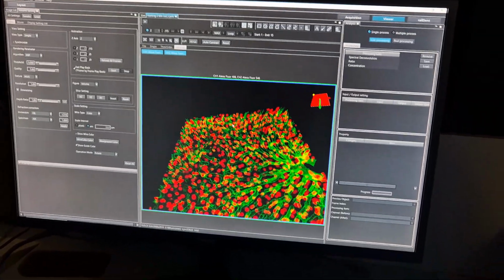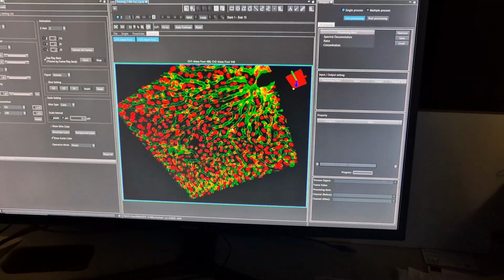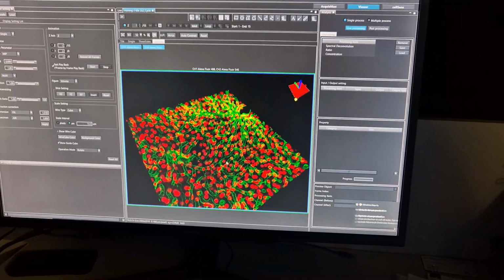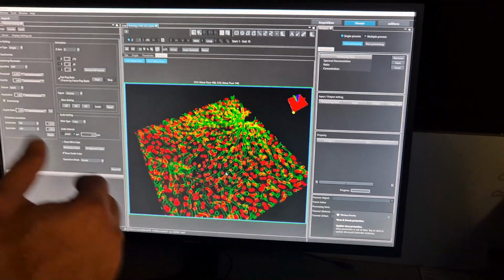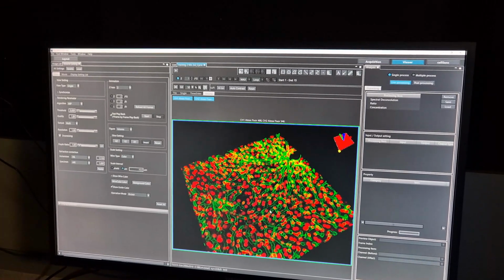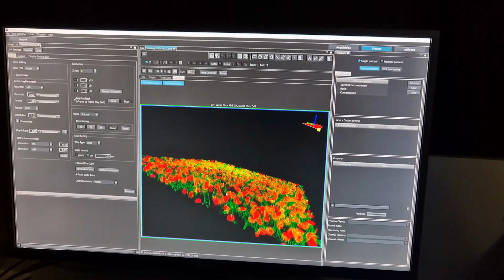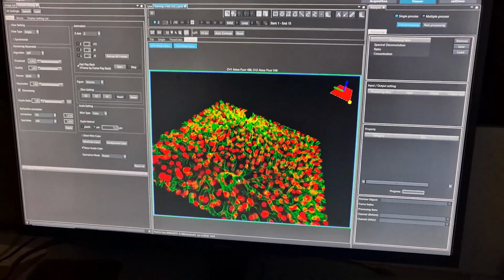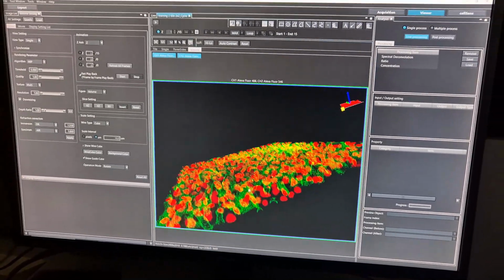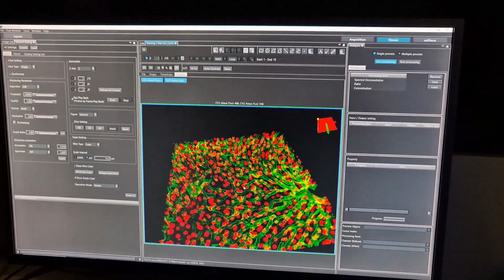Okay, there you go. So this time we have a shallower sample because we told it not to go too much. Also, we disobeyed the sampling recommendation because we reduced it from like 44 to 15 slices. That means with the step size, there's going to be gaps. And you can kind of see, if you look in this green, you can see the gaps. It's not as continuous as it could be, but you get the idea. It's for demonstration purposes, so you understand what's going on.